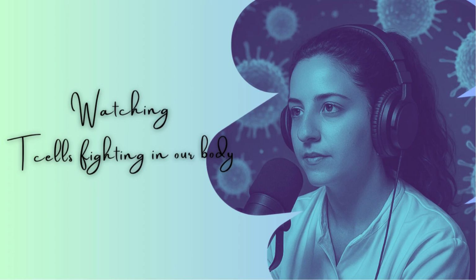So the gating strategies help you filter the data. First, you select live cells, then the lymphocytes, then CD3 positive T cells, and so on. This is actually applied by everyone who is investigating T cells using flow cytometry. Don't worry, I will be posting short reels explaining this.